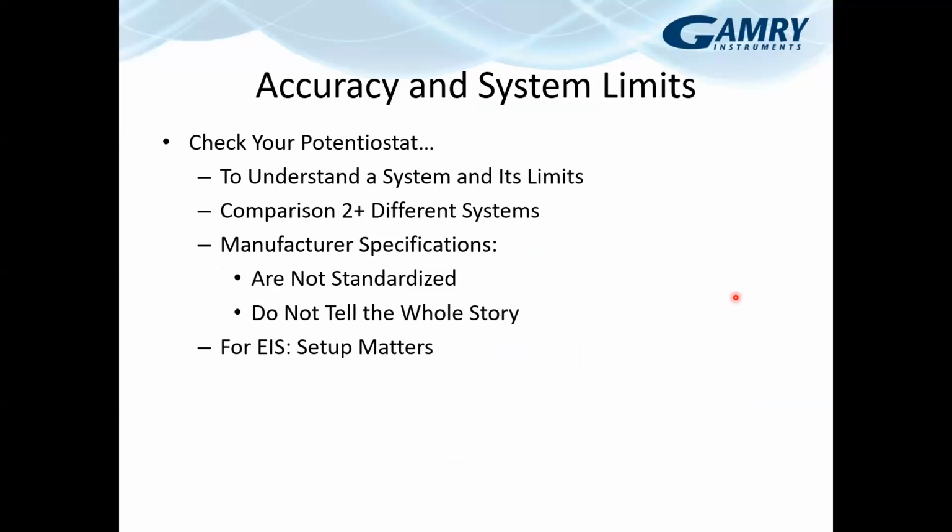So that's how it works internally. What does it mean to you? One of the things that is a good idea is to check your own potentiostat, whether you're using ours or something else.